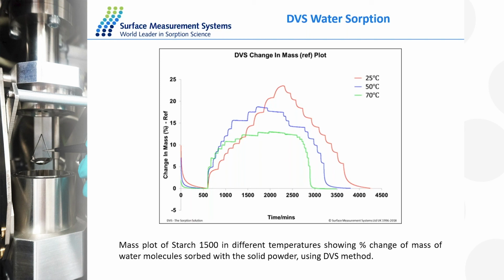Yes, it would be. Are you talking about 0% relative humidity and increasing just the temperature, or at different humidities? Yeah, the full isotherm, just as you pictured, just as we see here. At the full isotherm, yeah, then you should see a significant effect. And in fact, there is a method. What you see here is a step type method where the humidity is increased step by step. If you do a ramping method, you can see the effects more clearly for visualization purposes.